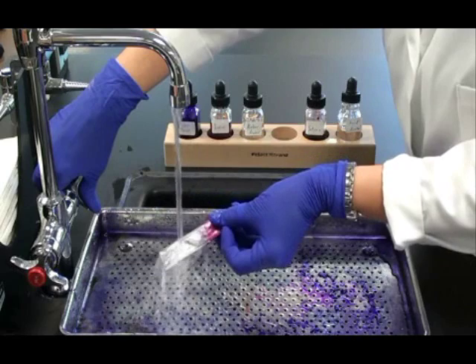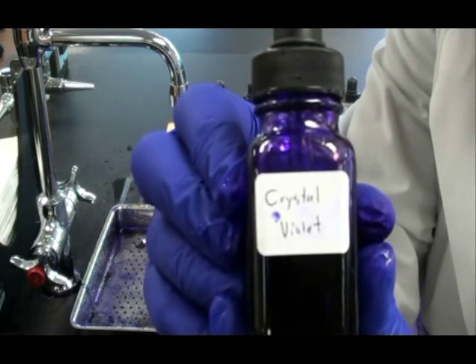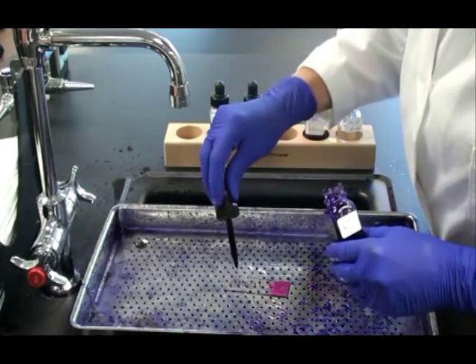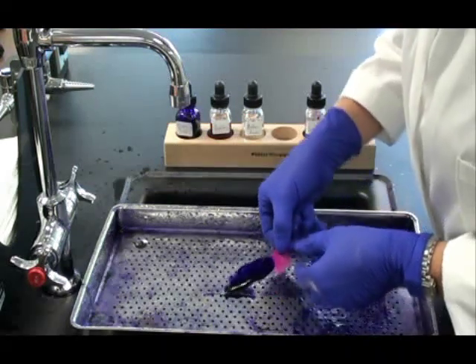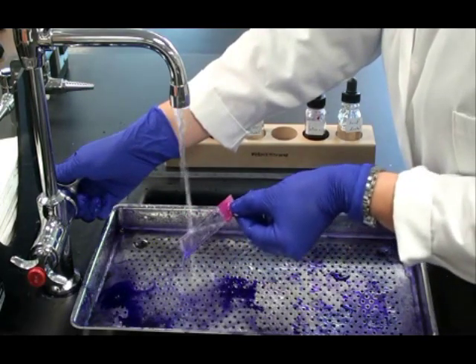After 10 to 15 seconds of decolorizer, I rinse my slide — I rinse between every step of this procedure. Now I'm ready to apply the counter stain, crystal violet. This will stain the non-acid fast or non-waxy cells a dark purple color. I drip that crystal violet onto the slide, making sure that it covers all three of the bacterial smears, and I leave that on for one minute. Now I'm going to rinse my slide for the last time, running water over it until the water coming off the slide runs clear.